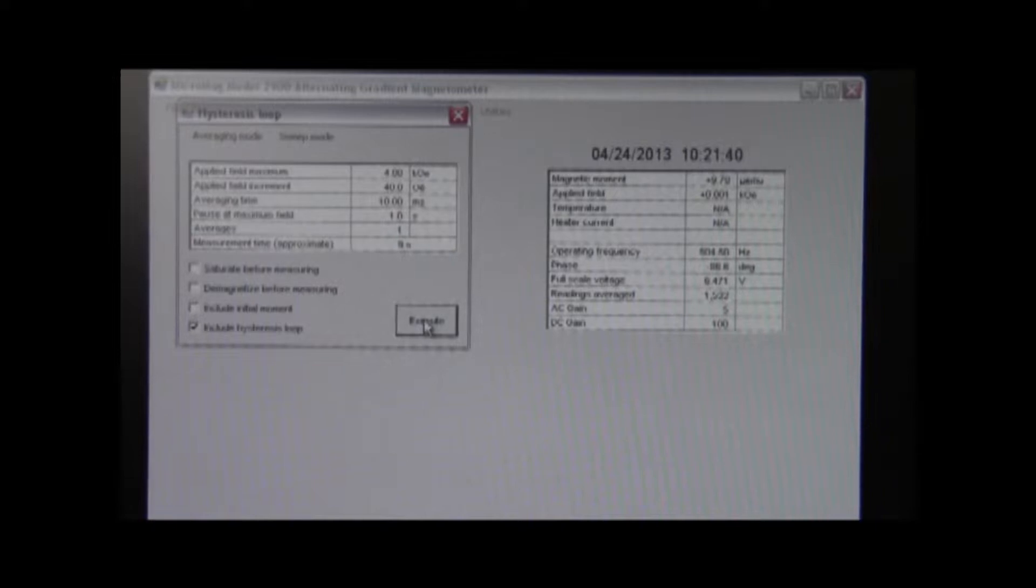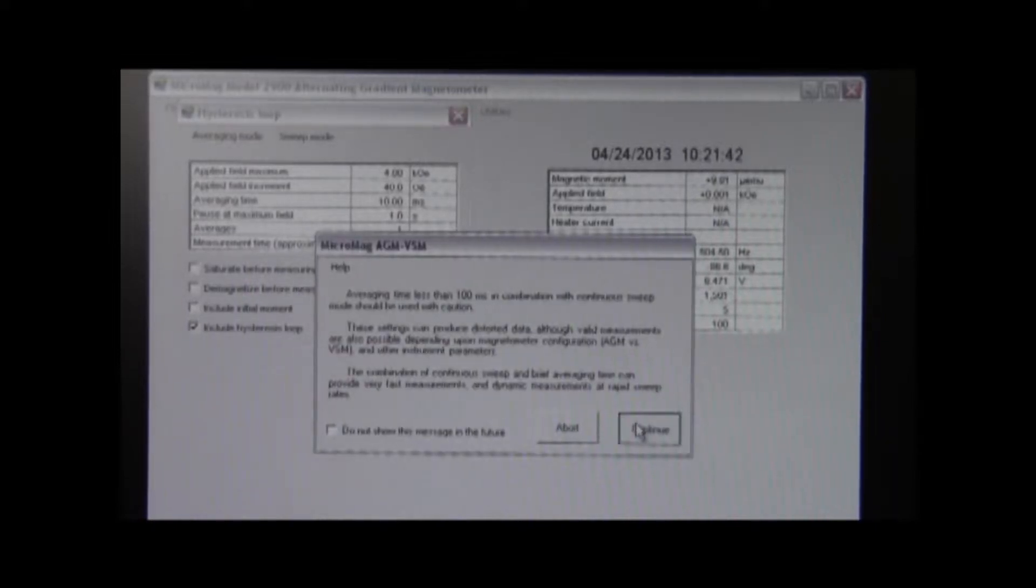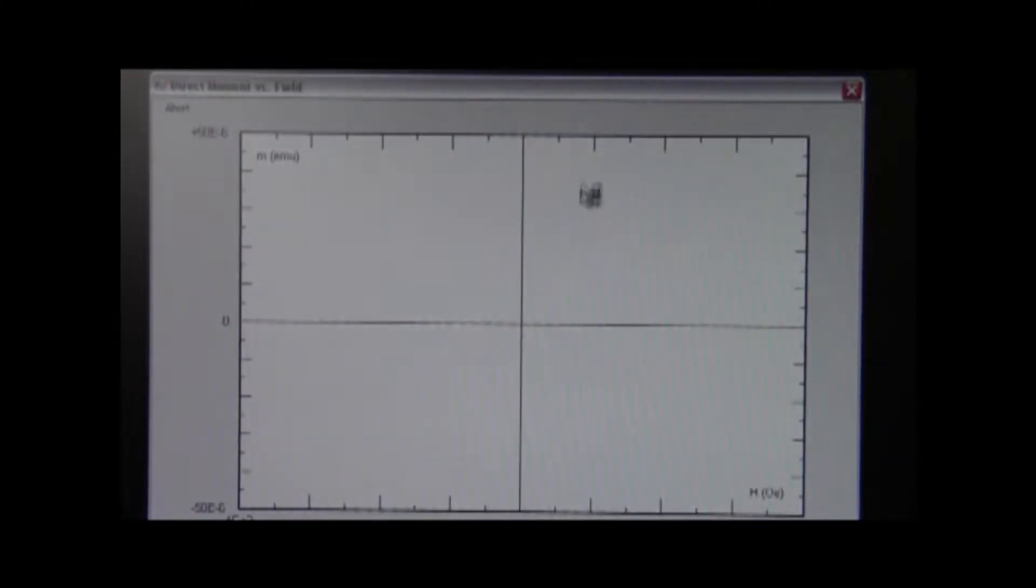We're going to select Execute, and continue, and here we go. There you go. It's done.